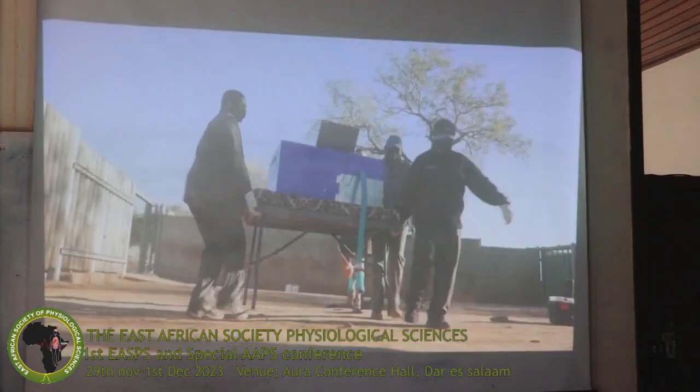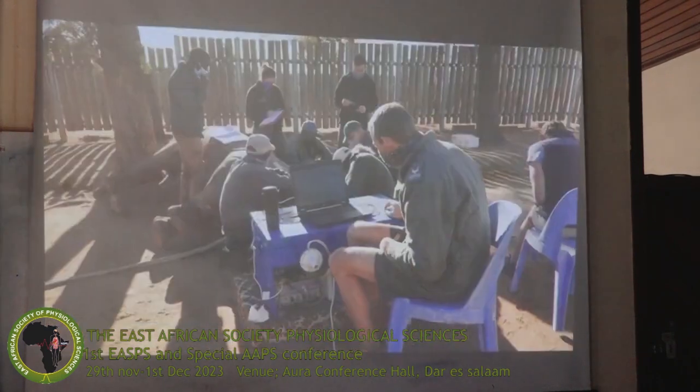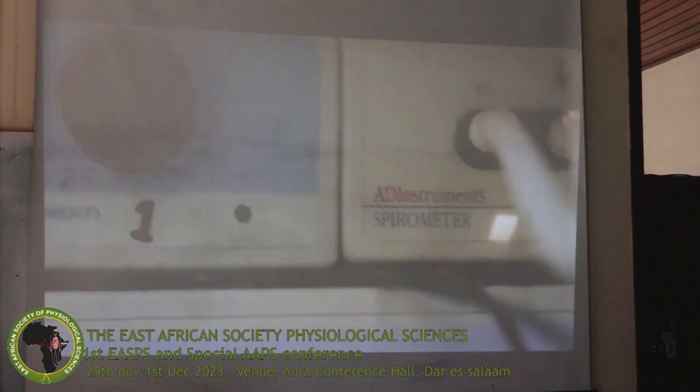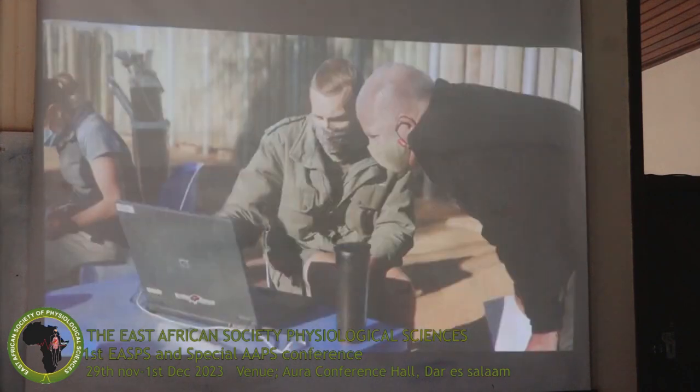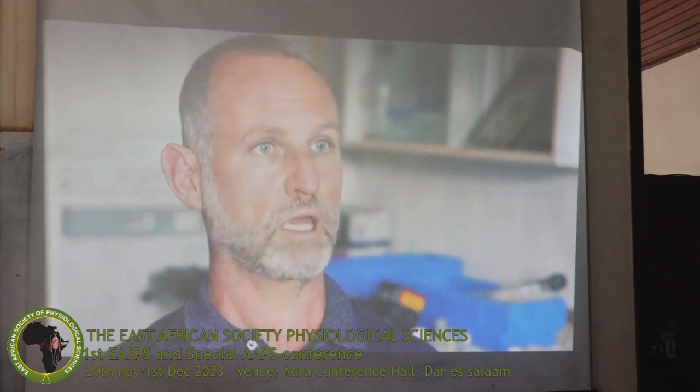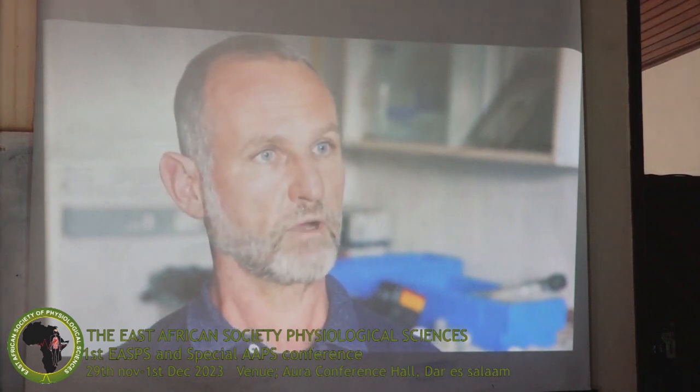The main things that we're measuring in these animals are the airflow, which is measured by a spirometer, and that allows us to measure the ventilation: how much the animals are breathing, how often they breathe in, the respiratory rate, and also the depth, which is called the tidal volume.